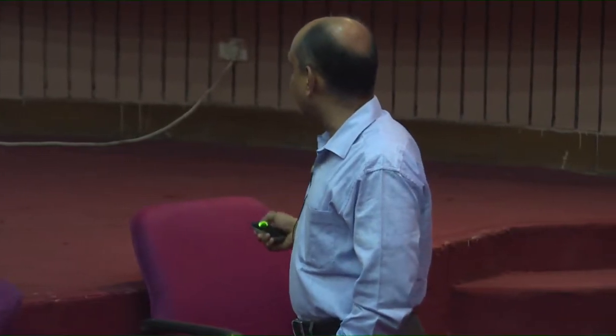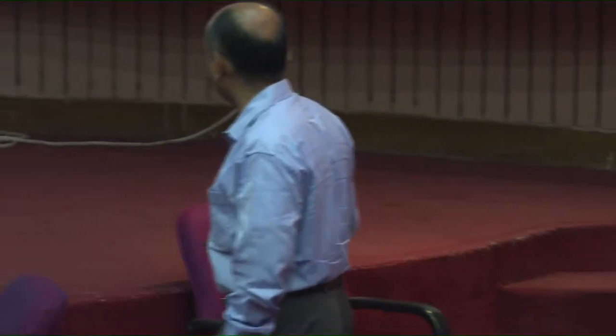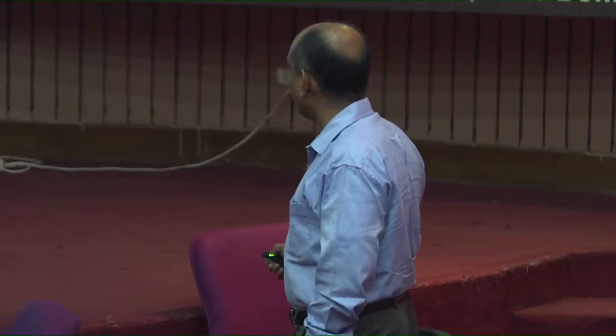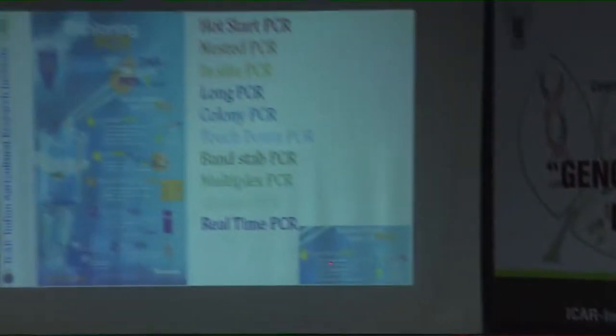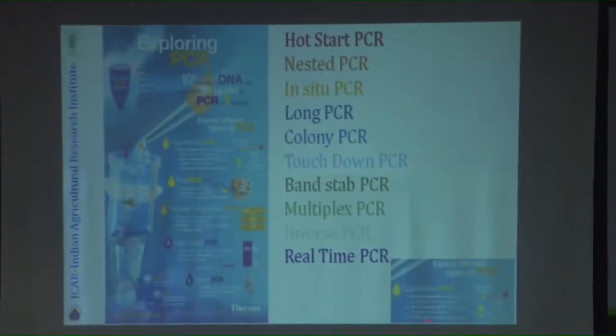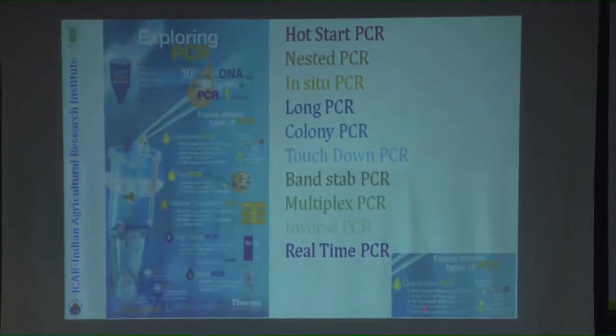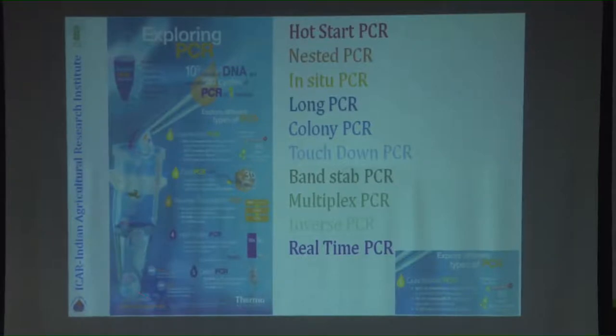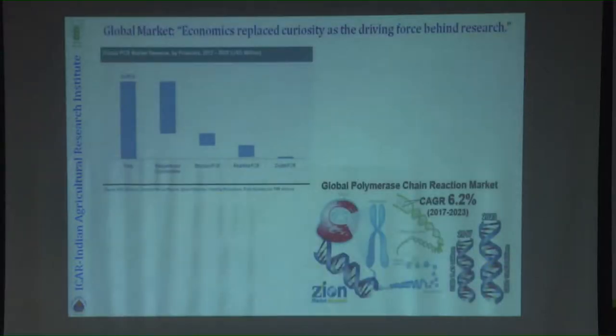And for quantitative PCR, almost 84% of researchers doing qPCR use hot-start DNA polymerase, and almost 79% analyze the qPCR data by the standard curve method. So these are a few things I wanted to introduce so that you will appreciate how these are being done and why researchers are after this particular process. I will also add an economic aspect to the whole process.